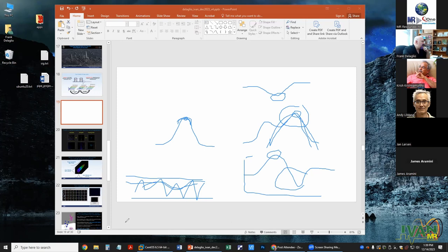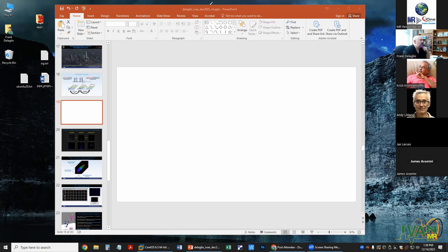Yeah. So when you say it estimates the line width, obviously it is using the Fourier transform result to... Right. So let's see if I can stop the annotation. Where do we go?